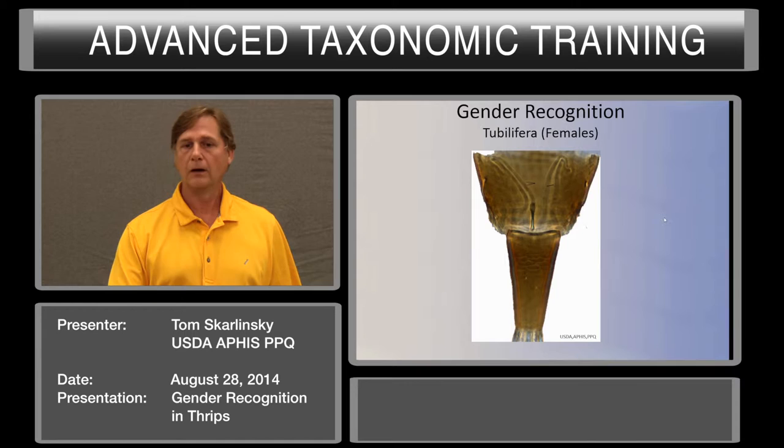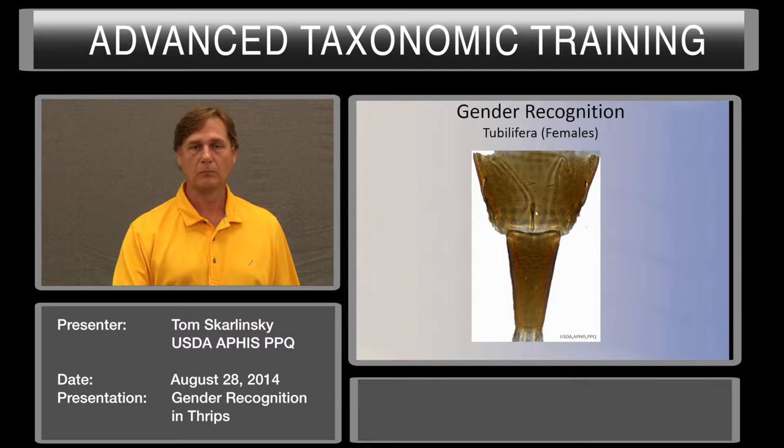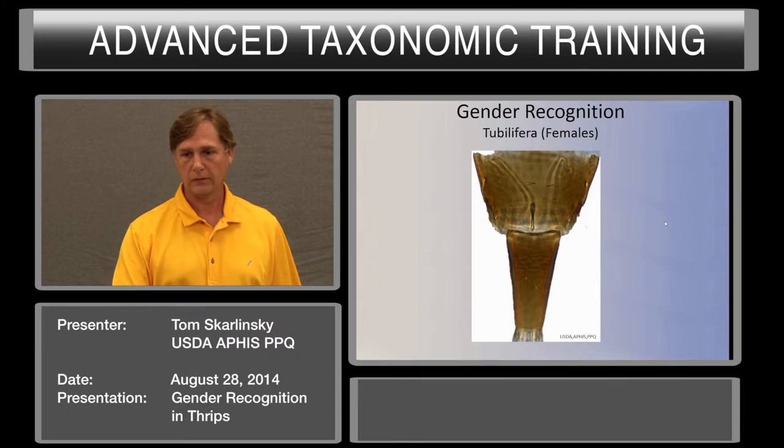Now in the Tubulifera, the females — you're going to identify those by this little sclerotized area right here. Some texts call it a fustus; others describe it as an eversible shoot-like area for depositing the eggs on the surface of leaves.